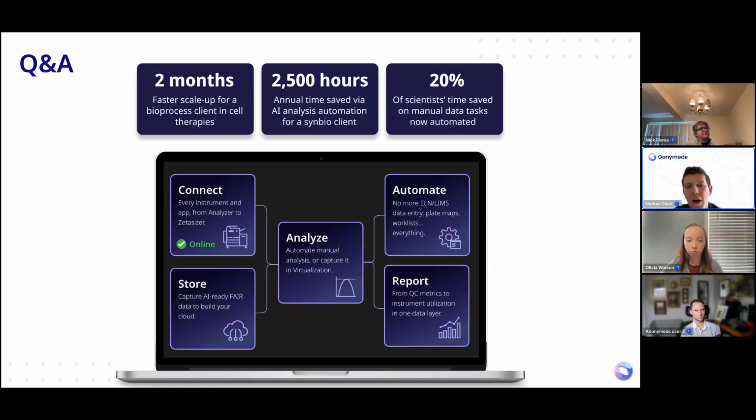But with that, I'll turn it over to Q&A. I know there's a couple great questions already. I'll turn to Dinesh's question on what types of bioreactors there are that this can work with.